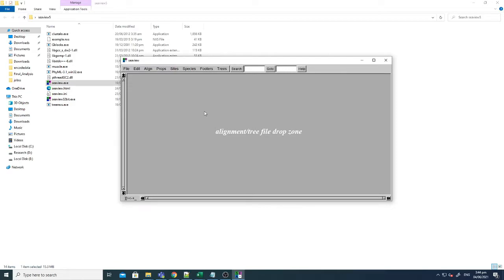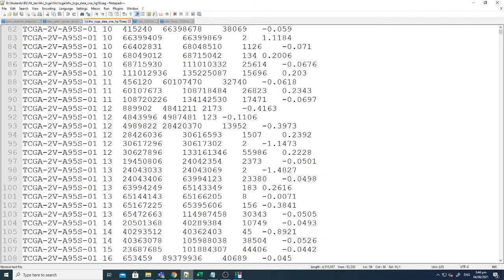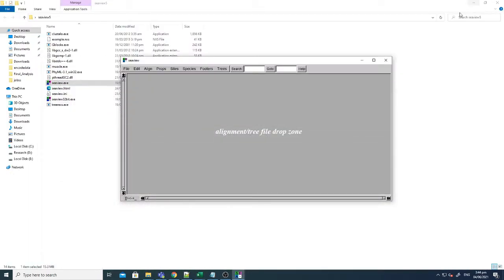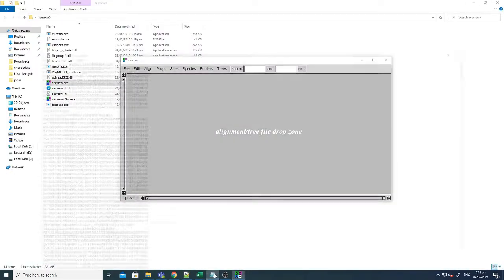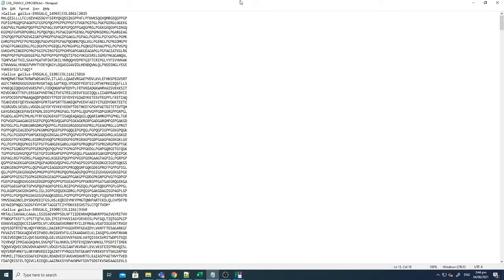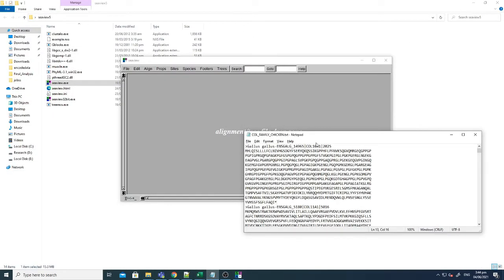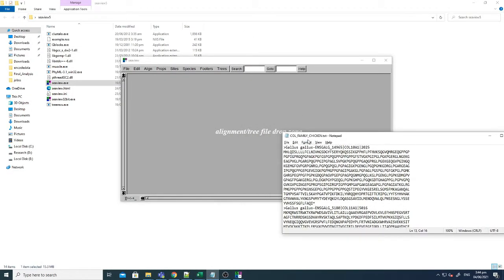And now if you want to build an alignment, what you need to do is to paste the FASTA format sequences here. For instance, I have already opened one sequence file here.